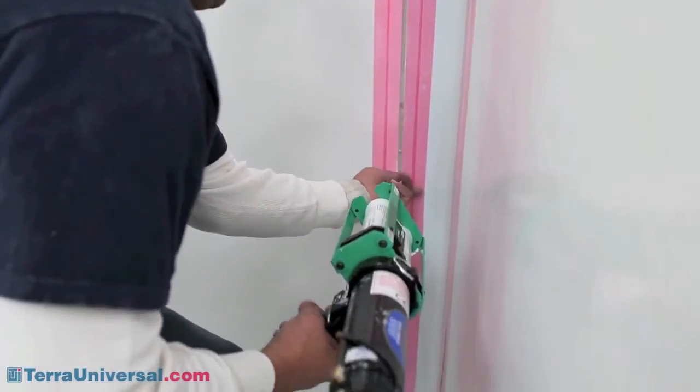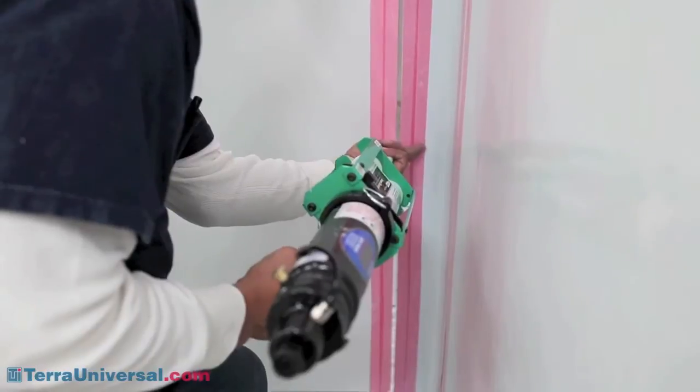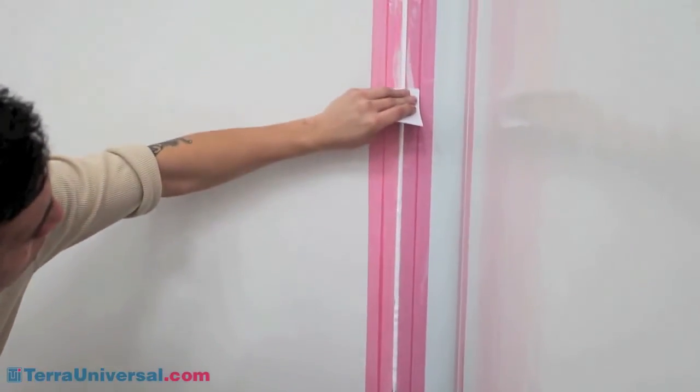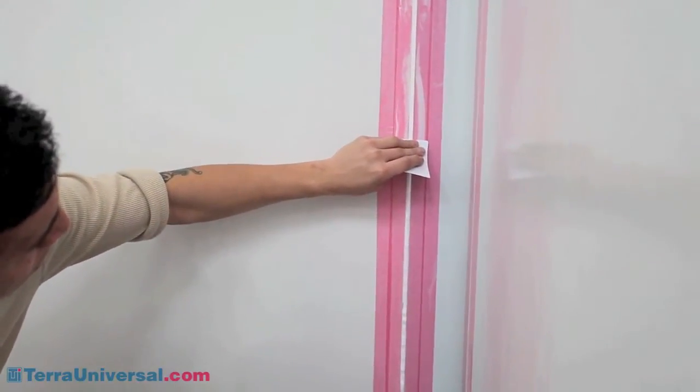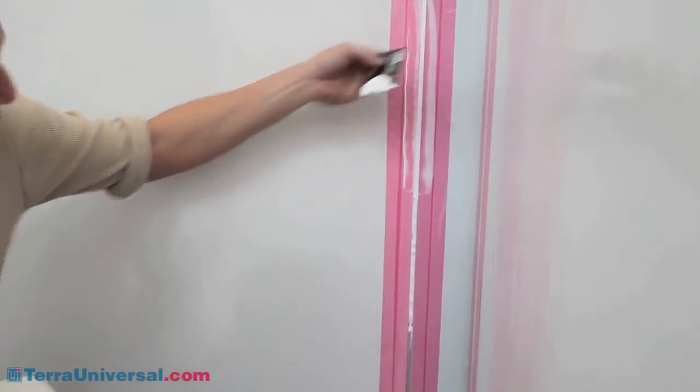A caulking gun is recommended for seaming, since the open time of the sealing container is very short. See our installation manual for a range of drying times in various environmental conditions. We recommend that a second person use a scraper to complete the smoothing of the sealant as it is applied.